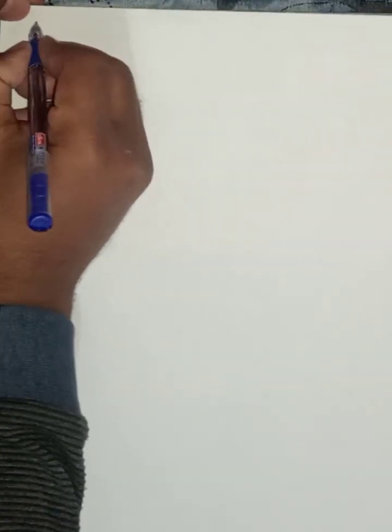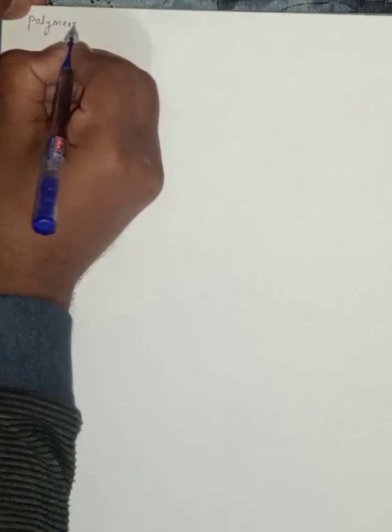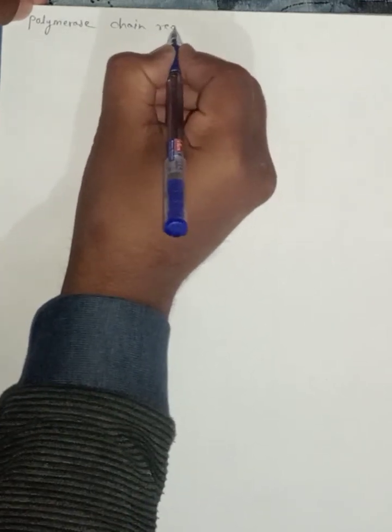First of all, we have to know what PCR is, so I will give some introduction to PCR. The full name of PCR is polymerase chain reaction.